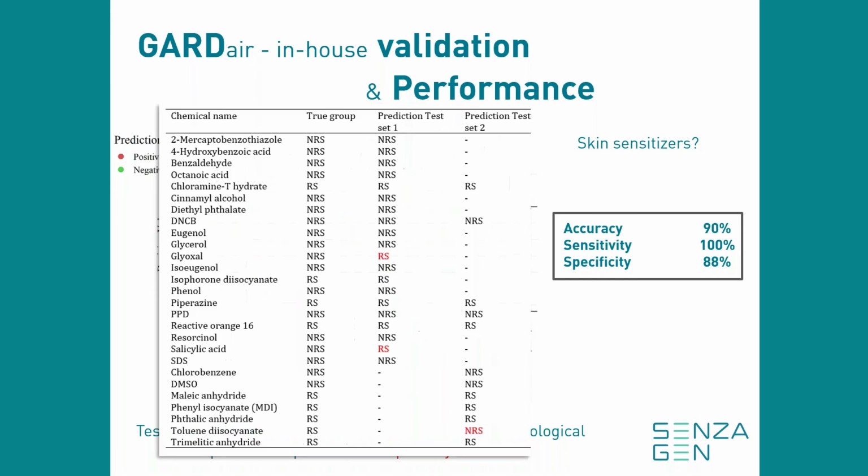So at the same time, we of course try to identify novel test compounds to test in our assay, to challenge our assay. And we are currently running through different type of test substances now. So this is basically to show here that regardless of what test set we use, we observe similar accuracies and performance of this assay.